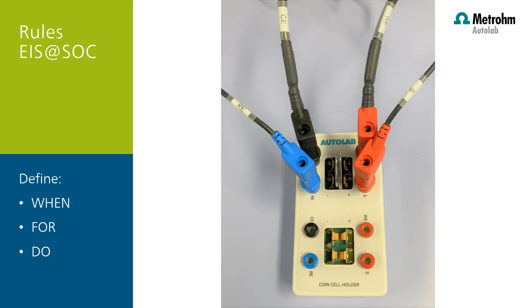The 'do' defines what should happen when the rule condition is met. There are two options: Stop command — the current command is stopped as soon as the rule is triggered and the procedure continues with the next command — or stop the procedure, where the complete procedure is stopped as soon as the rule is triggered. In this example, we program Intello to automatically start an impedance measurement when the potential of a battery reaches a certain threshold. We can do this after a charging and also after a discharging cycle, so we measure the impedance of the battery at a certain state of charge (SOC).